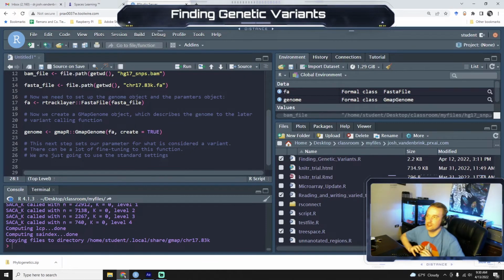And one thing that you could do too, if you were doing this for a research purpose, is get your BAM files and purposefully have a test set of BAM files where you make variants yourself. So you just go in and manually change some bases to make SNPs, and then see how good this is at identifying them, because you'll know ahead of time, right?